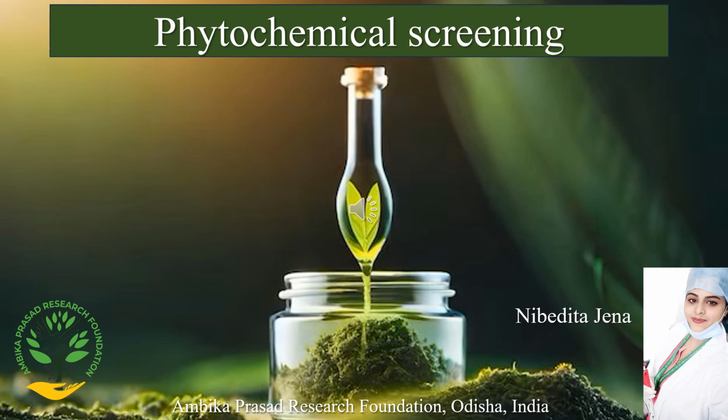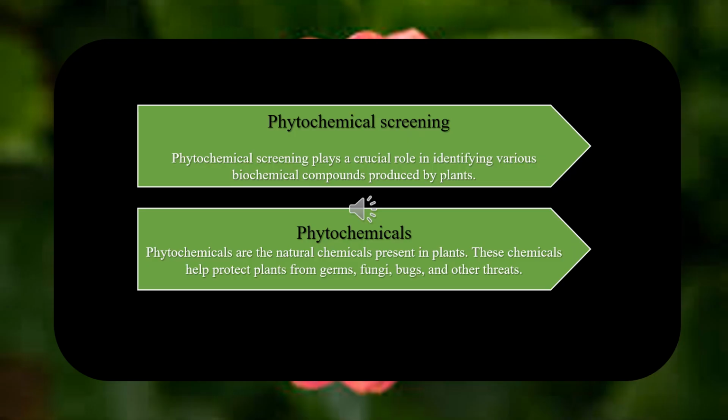So today we are going to discuss phytochemical screening. So let's start. Phytochemical screening techniques involve botanical identification, extraction with suitable solvents, purification, and characterization of the active constituents of pharmaceutical importance. This screening confirms the presence of phytoconstituents like alkaloids, flavonoids, glycosides, and lignins, which are biochemical compounds.